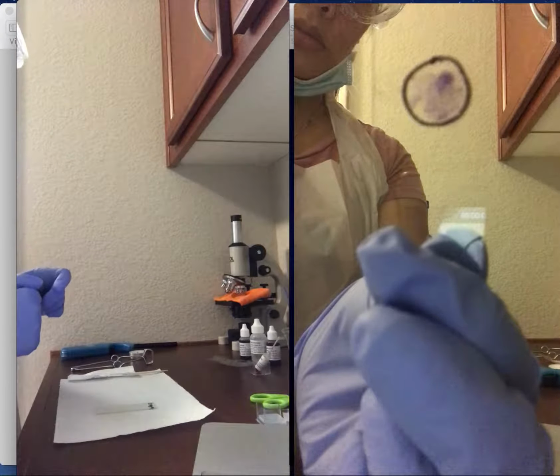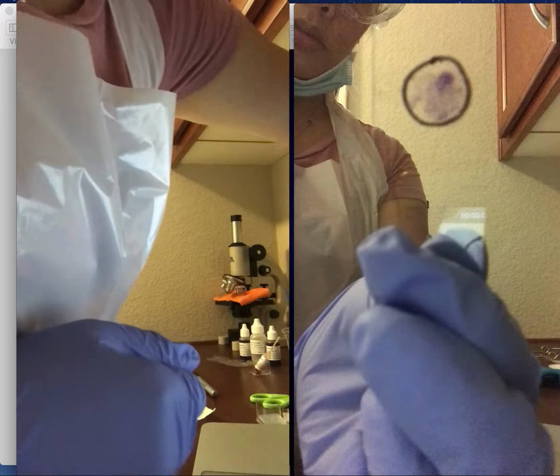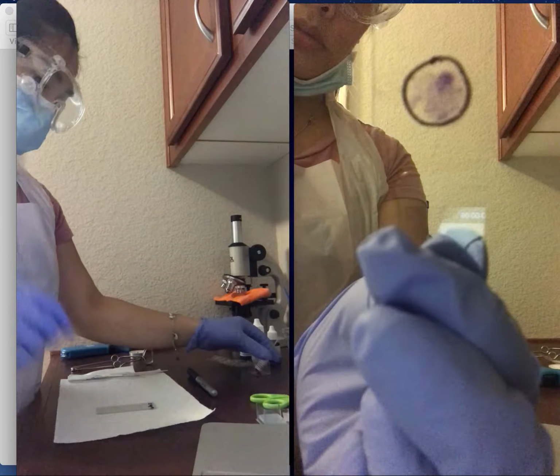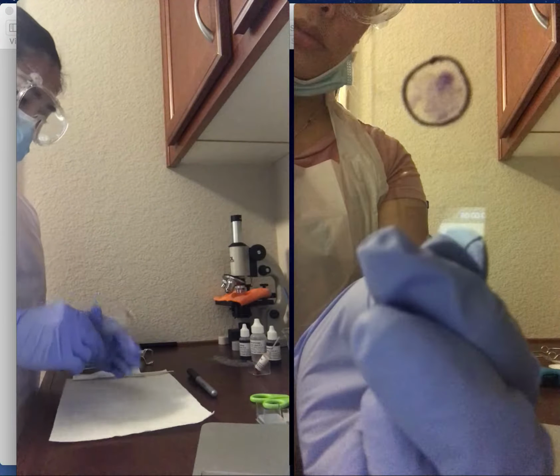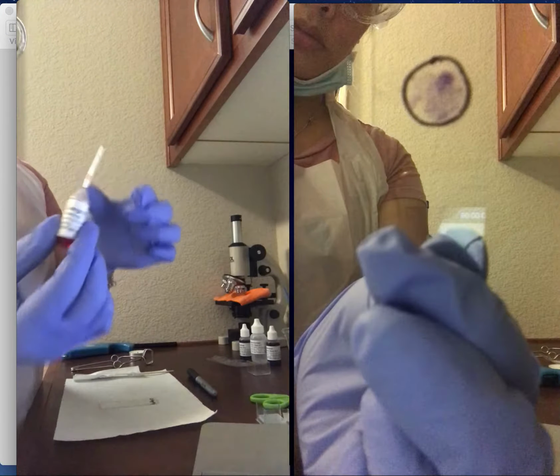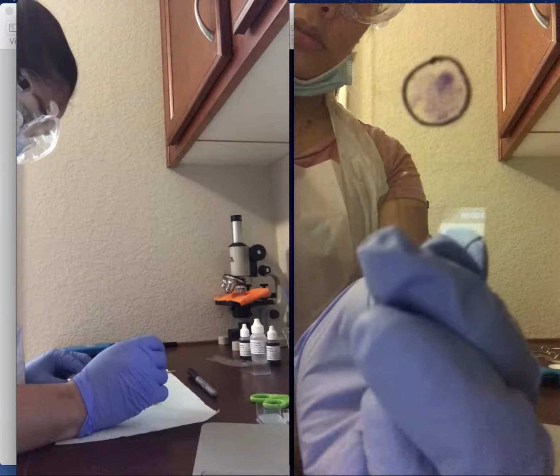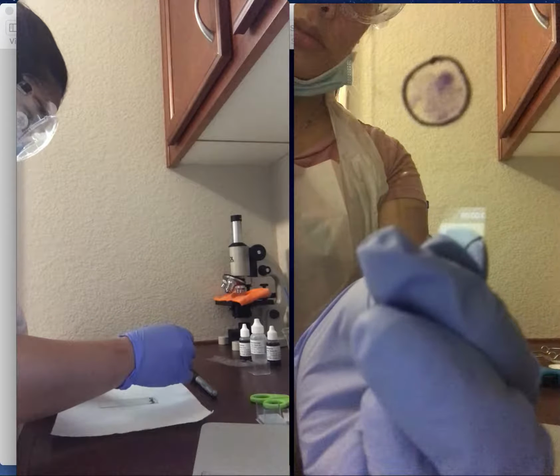So once we have labeled our slide, we are going to get our Congo red stain. Before we use the Congo red stain, make sure to cut the tip of it, and place a single drop on the slide.